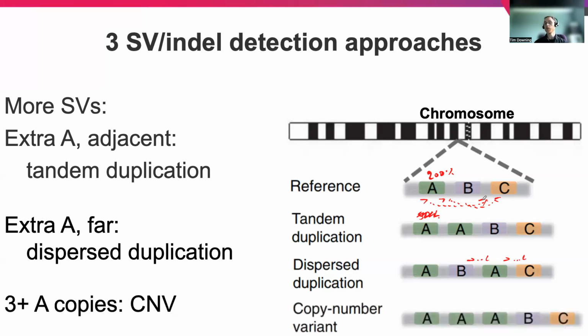And then we may have multiple copies. So the easiest way is that the level of coverage here increases at the single copy of A. And we expect, because there are reads here that map from A into A for each of these copies, that that coverage, if we draw it across here for our region A, will be at the normal level, and then it'll increase and then back down, but it'll do that before the boundary. So that boundary will be denoted again from this drop back in coverage.